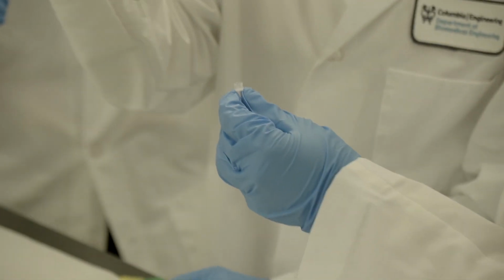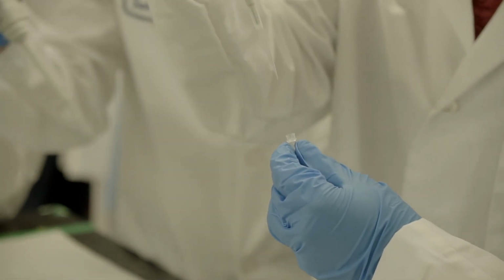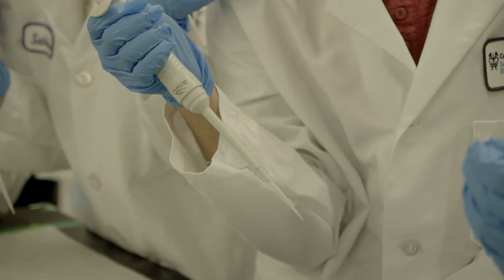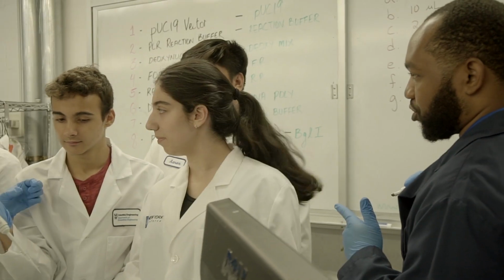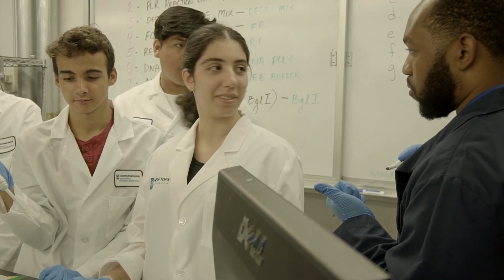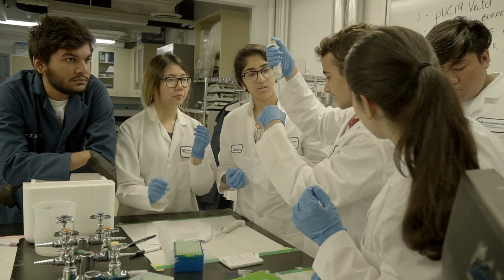So take it first off. Before you take it, first off. Then you put it. Now what did you all label? Then you pull out. There you go. For both of them? So you should have two tubes, right? One for PCR, one for restriction digest. So what's the name of your restriction digest? YA2. And PCR is YA1? Okay.